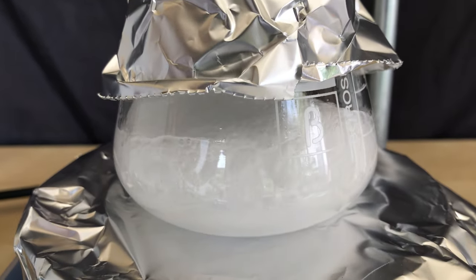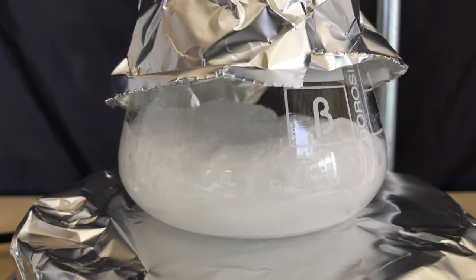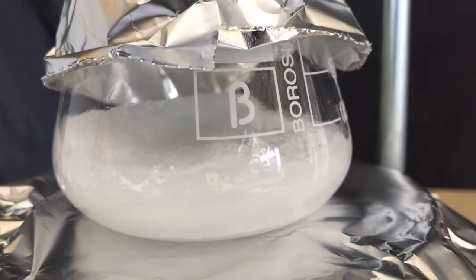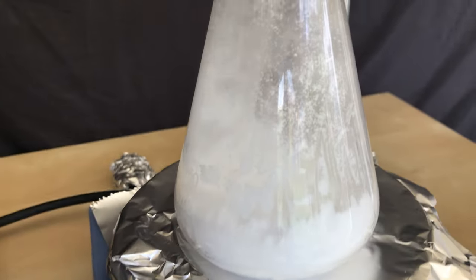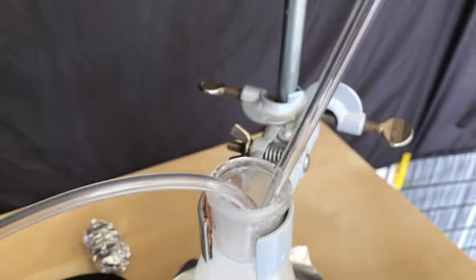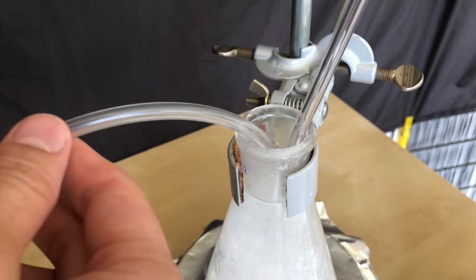When most of the ether was gone we were left with this white gooey substance. The hotplate was cranked up to 140 degrees celsius and I waited until the product was dry. To get rid of the last bit of ether we blew air into the Erlenmeyer flask.